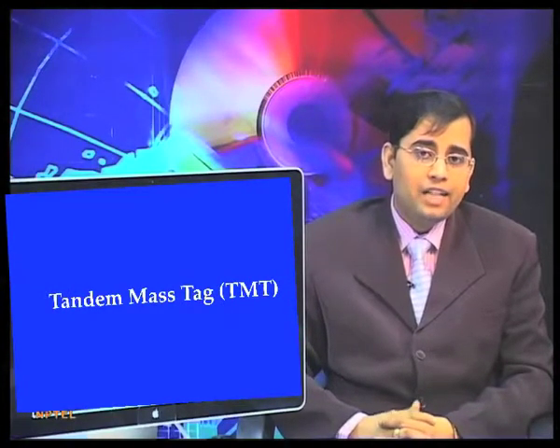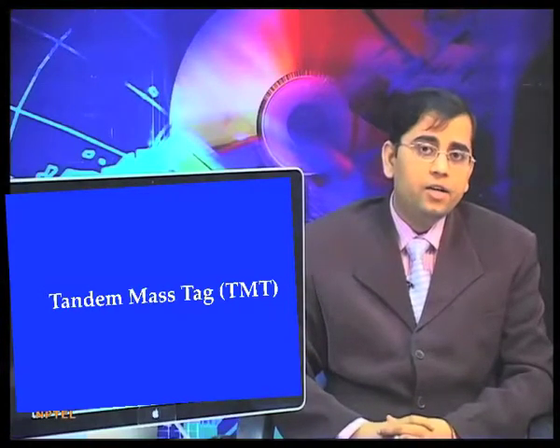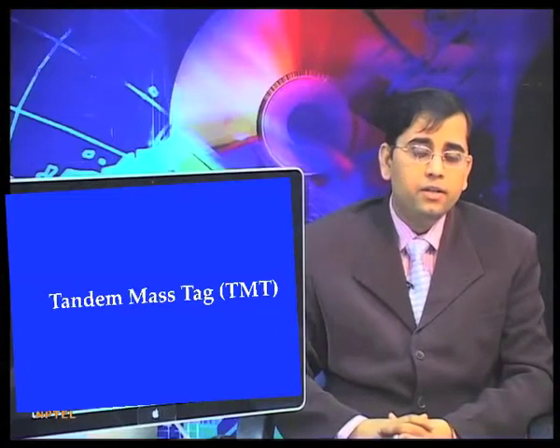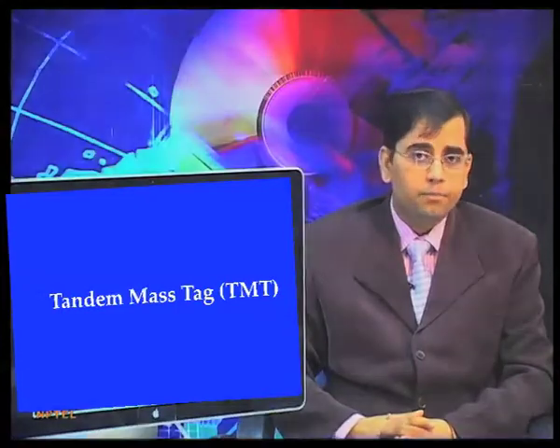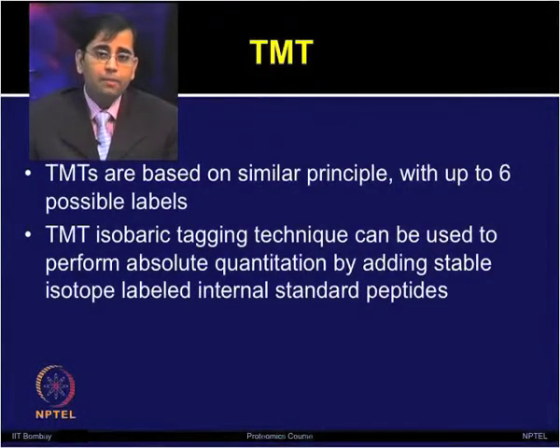The tandem mass tags have been developed by Proteome Sciences and are currently commercialized by Thermo Fisher. I have given you the reference for the original study on tandem mass tag in the slide. These tandem mass tags are based on a similar principle to iTRAQ. Here the possibility for multiplexing is up to 6 possible labels.